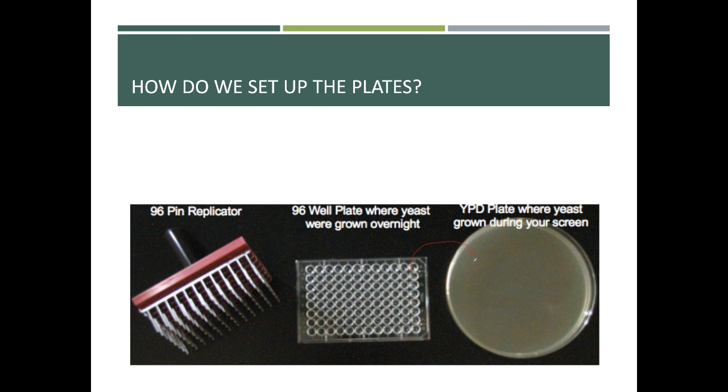And in doing so, in about 10 seconds, you've inoculated this plate with 96 cultures of yeast all at the same time. And actually I should have said 95 cultures, because one of those wells should be blank with no cells in it. Just real quick, I just casually threw out YPD, but I should have defined what that was. This is just the standard growth media that yeast grow on. That's all the nutrients they'd want. It's like a yeast smorgasbord buffet. They love this stuff. Now you add a stress to it, they don't like it as much.